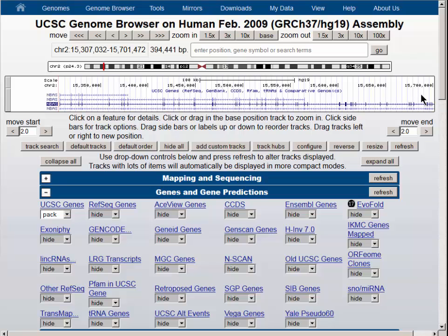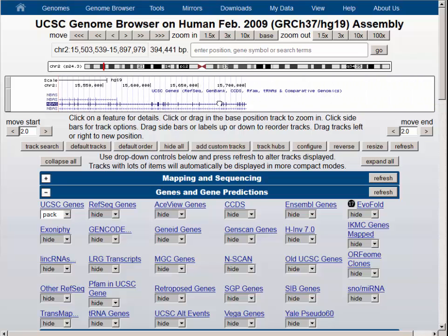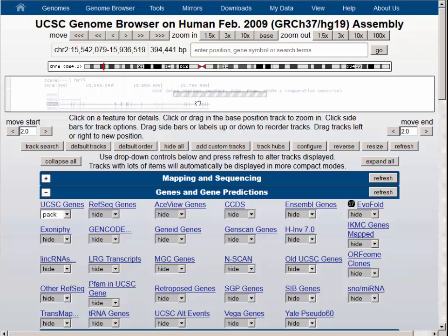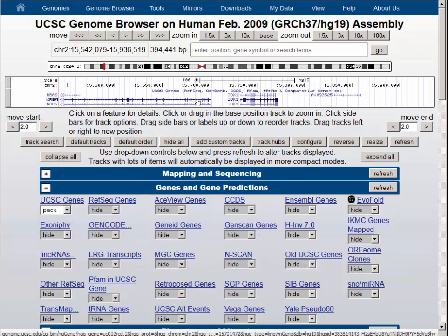It is also interesting because to the right-hand side of this gene is another gene, the DDX1 gene. The two of them are transcribed in opposite directions. So it's a nice easy location to observe that we really do have the upstream regions before we proceed with the intersection.